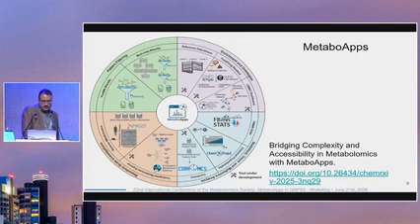The second one is the enrichment and ontologies. Those are based on reference data driven. So we have the MSMS spectra, and then we classify them as different levels of information based on the metadata that you provide on the repository. We have then the food and drug readouts that we're going to see in more detail now, that are ideally going to help you visualize and interpret the information from your biological samples connected to the information on the mass spectral data.